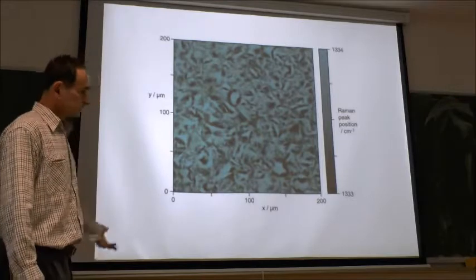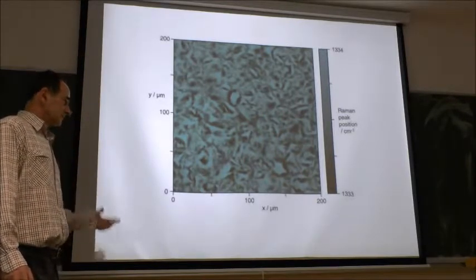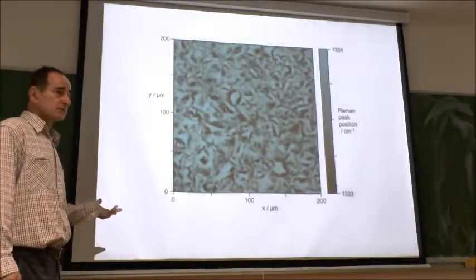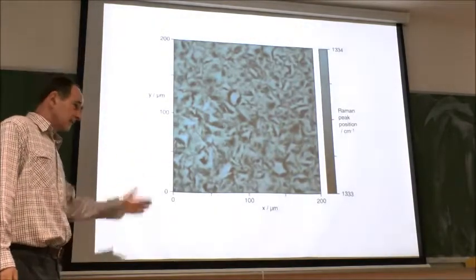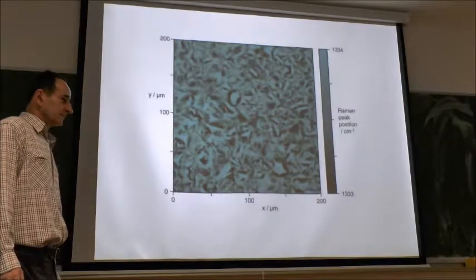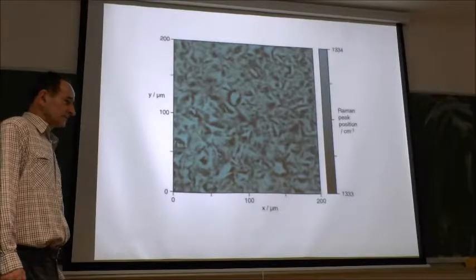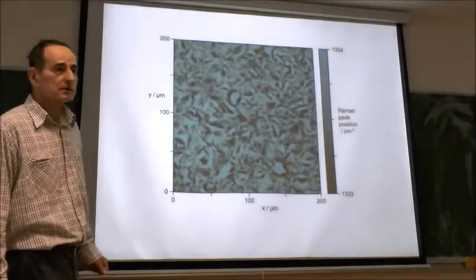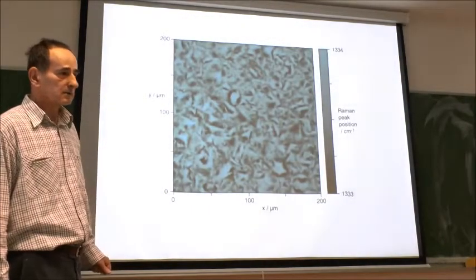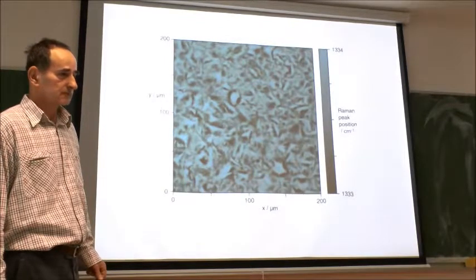So the resolution is below 1 micron lateral, around 0.2 microns. But even higher resolution is possible with the next talk, LFM. That would be a much better resolution than this instrument. This half micron, it's the resolution of the stage, and what's the spot size? The resolution depends on the objective you use and on the laser that you use.